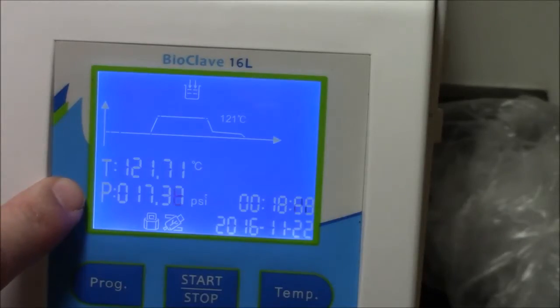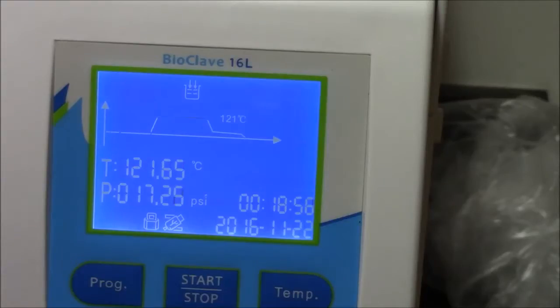The pressure is a little bit greater than two atmospheres inside. This is on top of the one atmosphere that we have all around us.